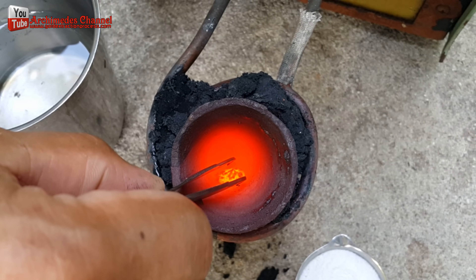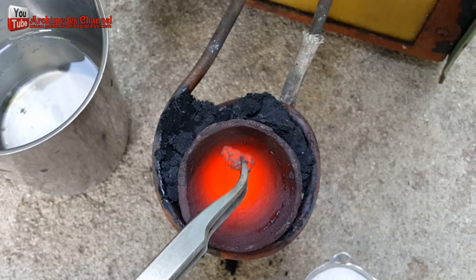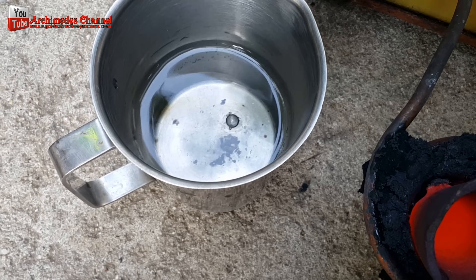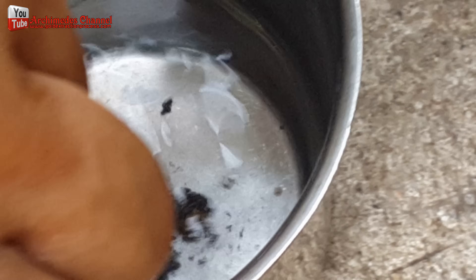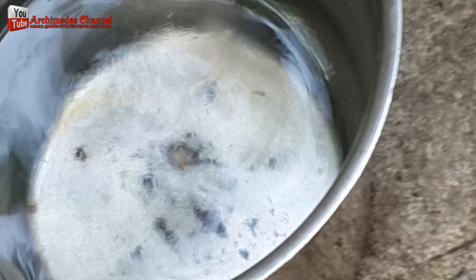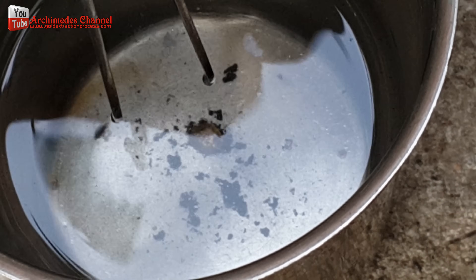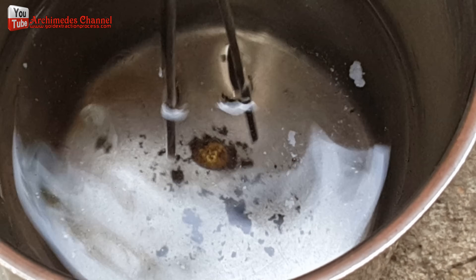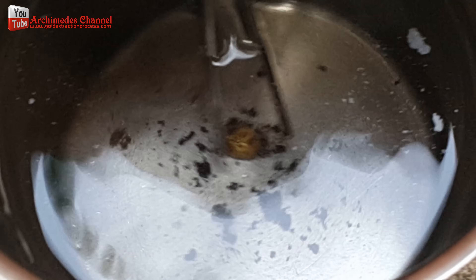I placed the hard but still hot gold particles into a mixture of two parts nitric acid and one part water. This solution further cleans the gold particles. I obtained a little more gold.